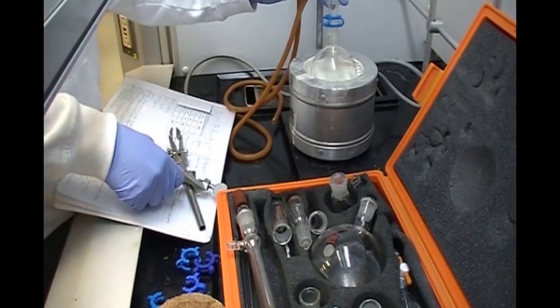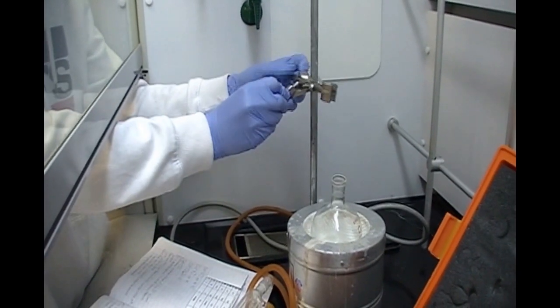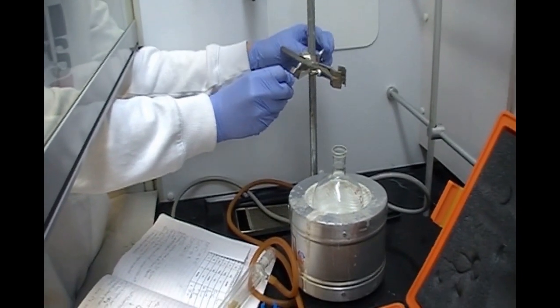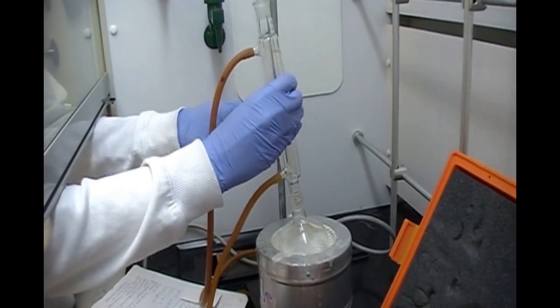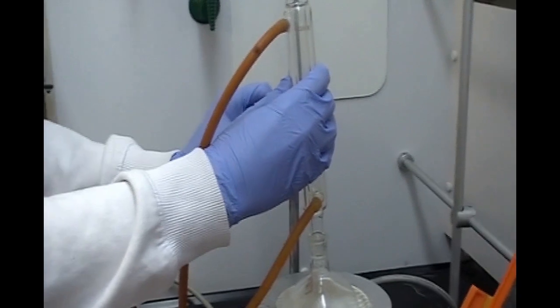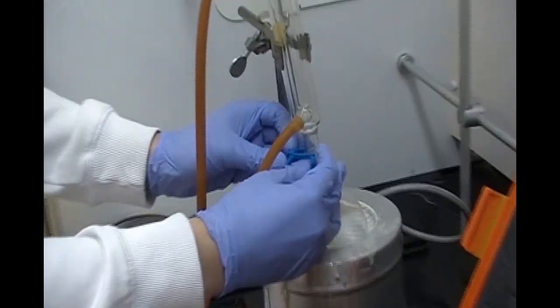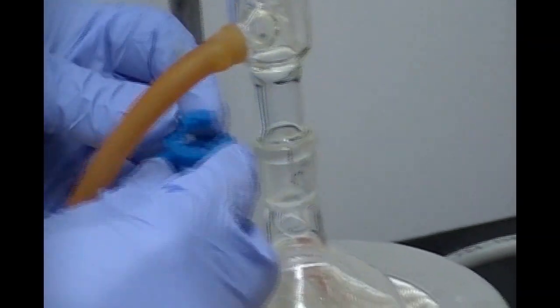Be sure to first fasten your condenser to the ring stand above, in order to avoid mistakes as you see on screen here. Make sure that every tube is securely fastened and that the water is turned on gently in order to ensure that the tube does not pop off.